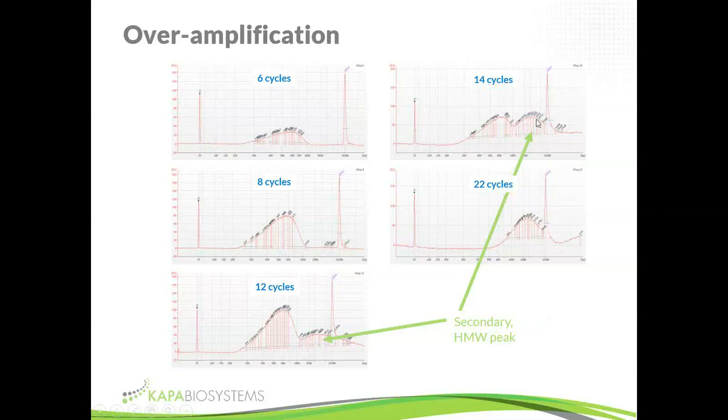These are just short molecules that are totally sequenceable, that are basically illegitimately annealed to one another at this point because the primer ran out and you're now still working at room temperature for the analysis. So when you go to cluster amplification, these molecules come apart, they cluster perfectly, they sequence perfectly. When you go to hybridization, same thing, they come apart and can participate in the hybridization reaction.